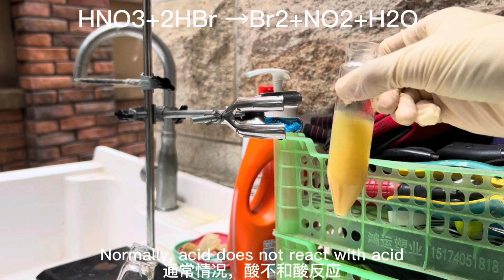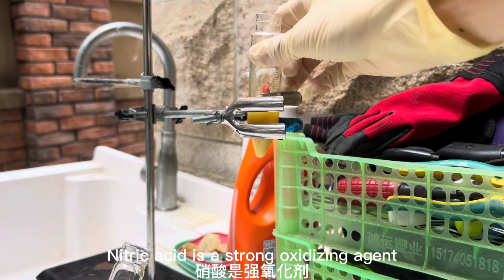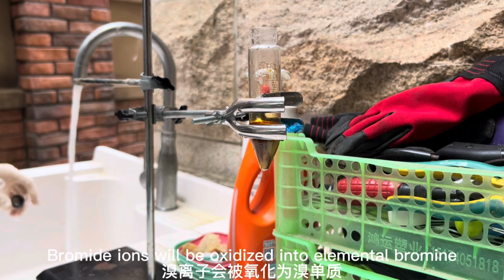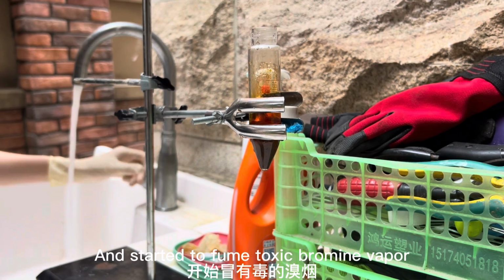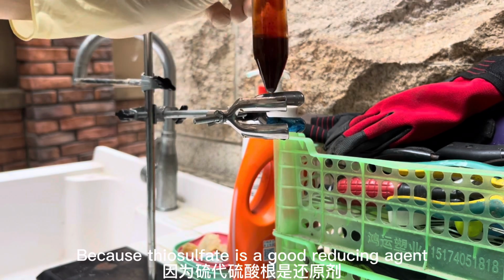Normally, acid does not react with acid, but in this case, it is a redox reaction. Nitric acid is a strong oxidizing agent, whereas hydrobromic acid is a reducing reagent. Bromide ions will be oxidized into elemental bromine. This test tube is getting darker and darker, and started to fill with toxic bromine vapor. You can use sodium thiosulfate to deal with the waste, because thiosulfate is a good reducing agent.